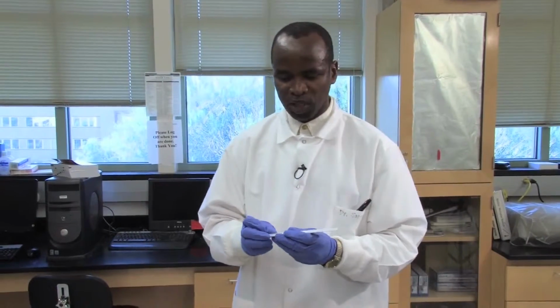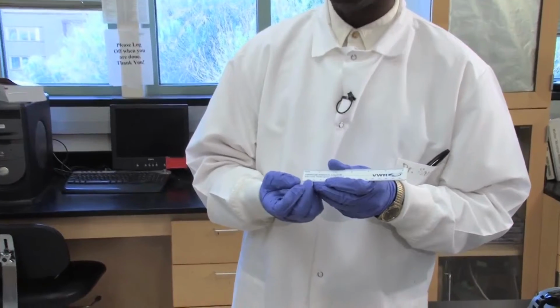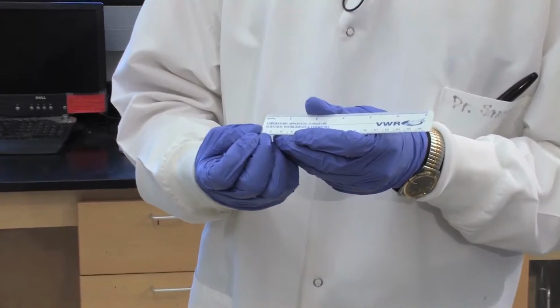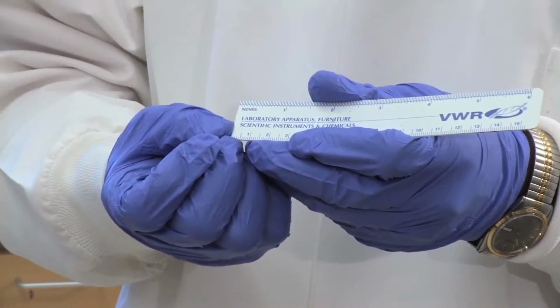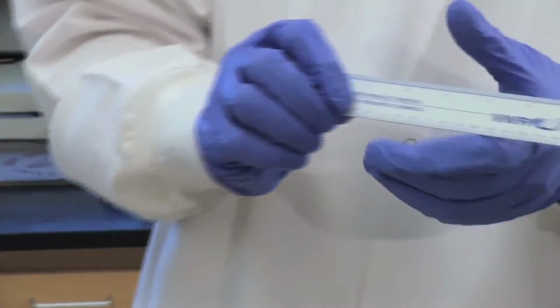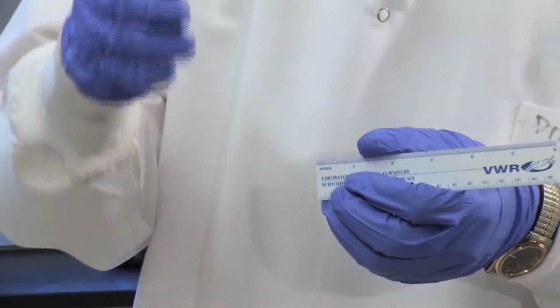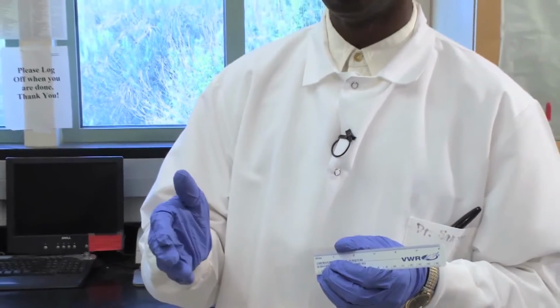And if we think about the size, here's a ruler showing you the different division. This is in centimeter. So if you look at 1 centimeter, it's about 10 millimeter. And 1 millimeter, you have to divide that by 1,000 to get 1 micron. And many of the particulate that we should be concerned about in human health are those below 5 micron, especially in the range of 1 to 2, because they tend to be retained in our lungs.